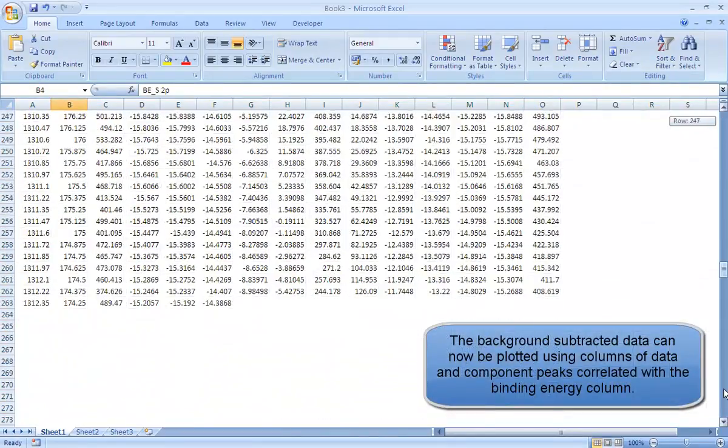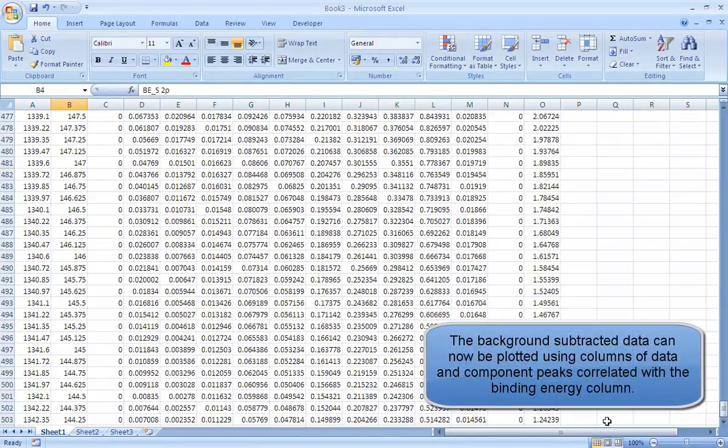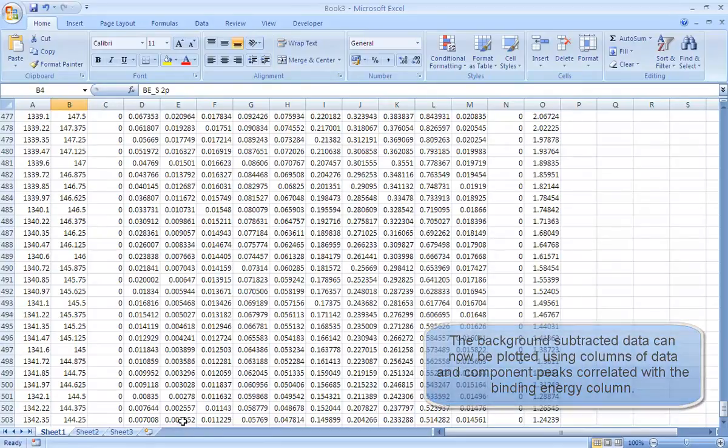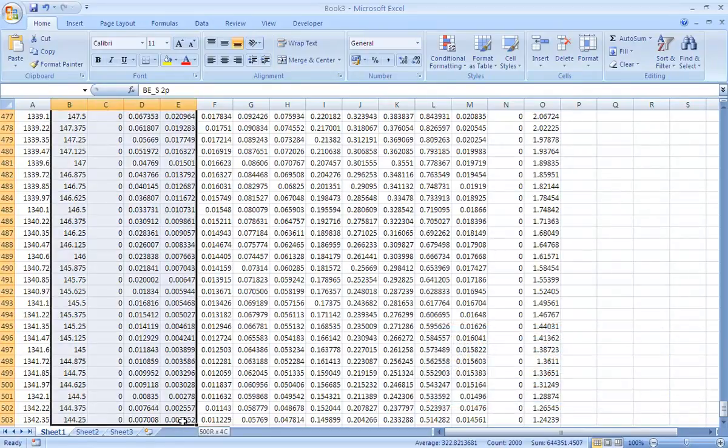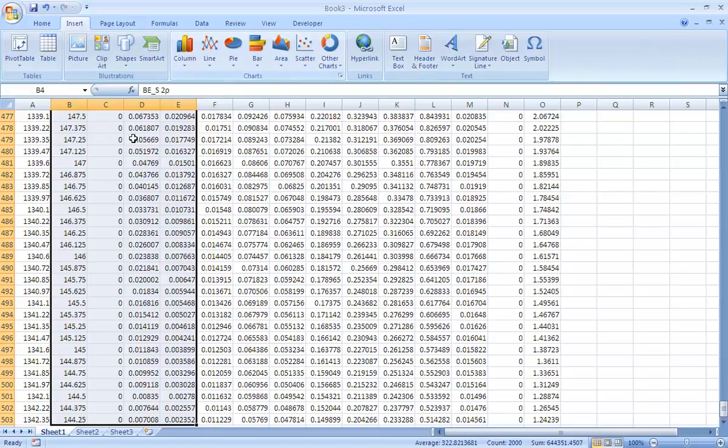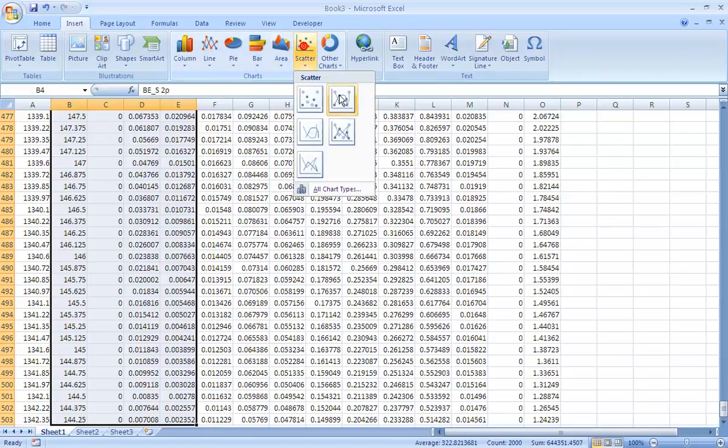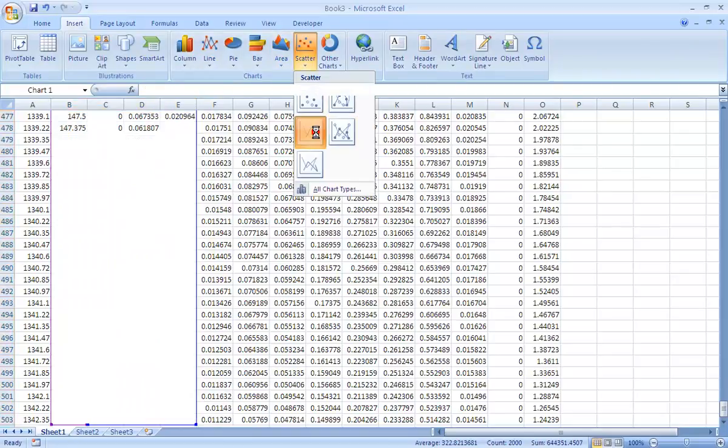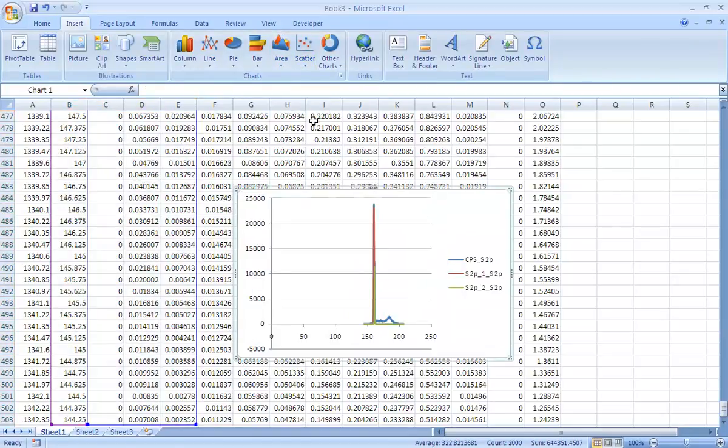So just to illustrate, you get a set of columns. Each column represents binding energy - you've got the counts and you've got each component in this data set.